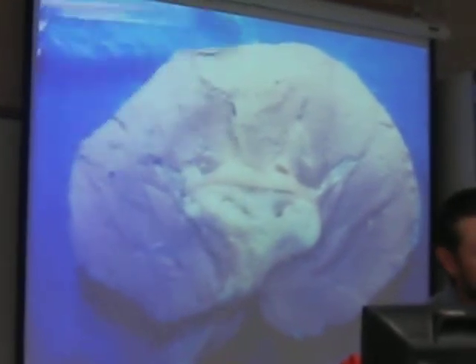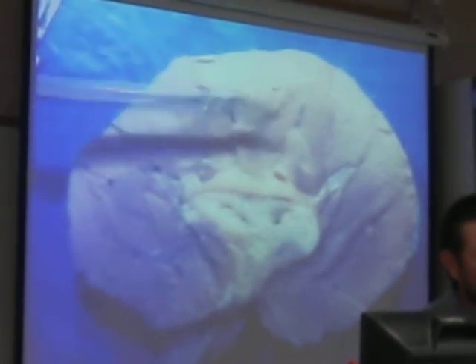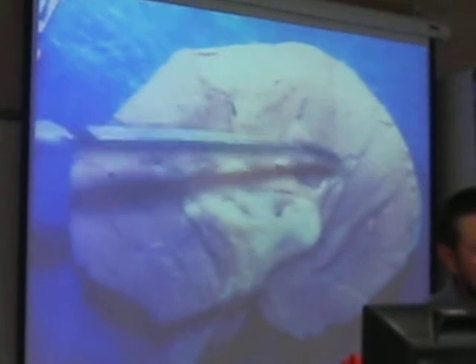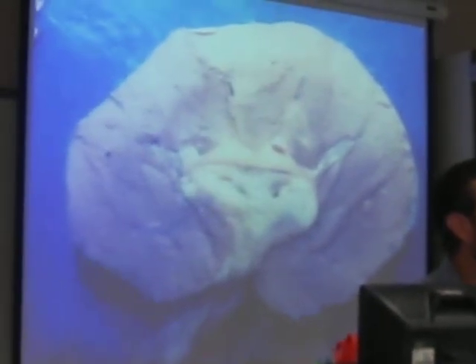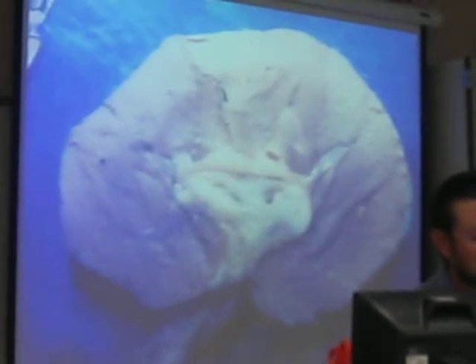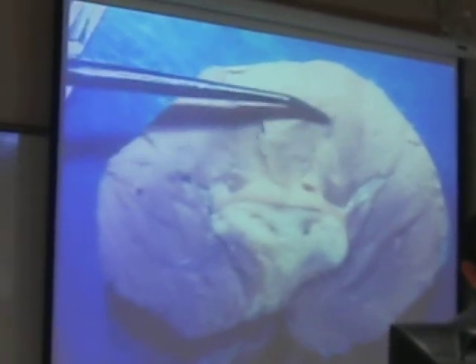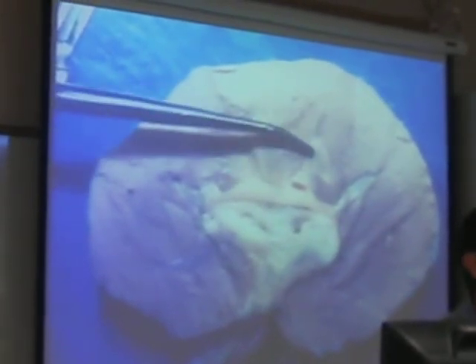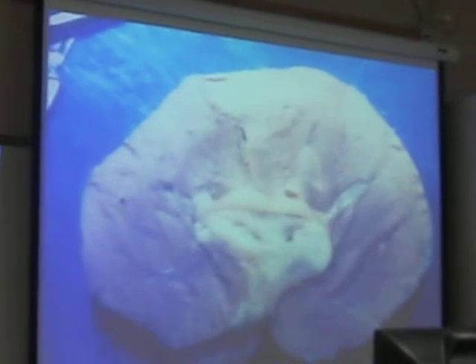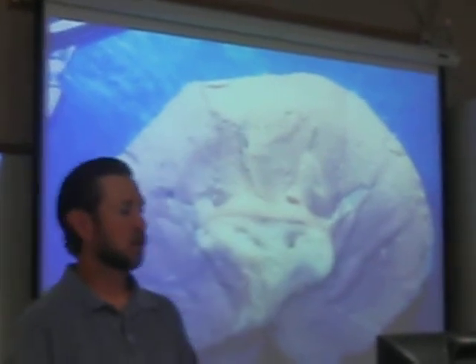But don't just stop there. The important thing is to not just be able to identify this, but what would you find here? What's in here? Okay, and what's the tissue that makes up those structures? What's their function? What is plugged in and out? Anyone know right offhand what specific blood vessels you find in the columns? That's something you'll work on soon. Interlobar arteries? Close. Interlobar arteries and veins.